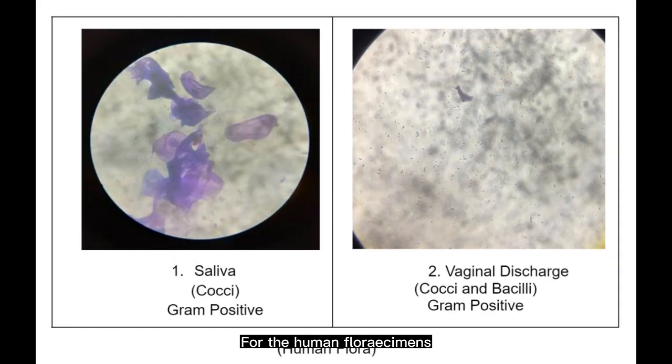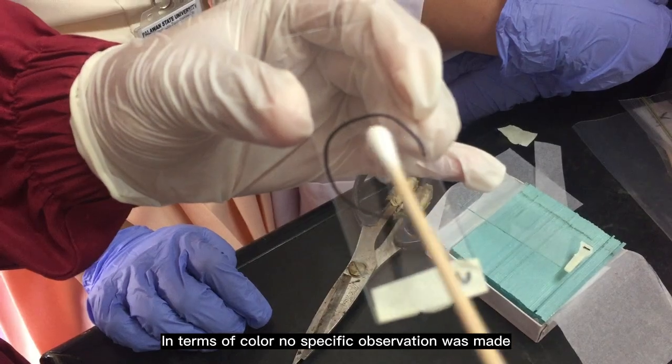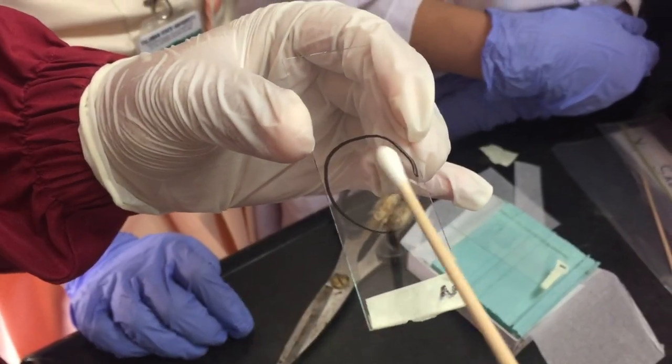For the human flora specimens, vaginal discharge contains Gram-positive bacilli, and both saliva and vaginal discharge contain Gram-positive cocci. In terms of color, no specific observation was made except for their translucent or whitish appearance.